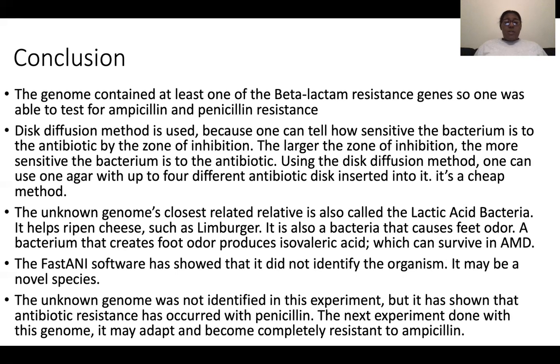The FastANI software showed that it did not identify the organism and that it may be a novel species. I say that because ANI software showed that the two bacteria are over 91% similar, but it did not meet the accepted threshold of 95%. So they are closely related, but CC genome may be a novel species.